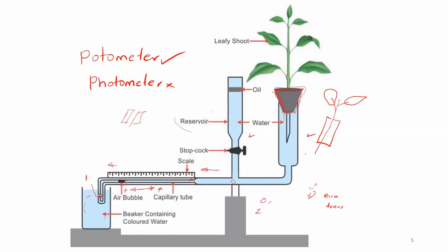Then allow again 5 minutes and observe in which direction the air bubble moves. That's our observation. Is it okay now?